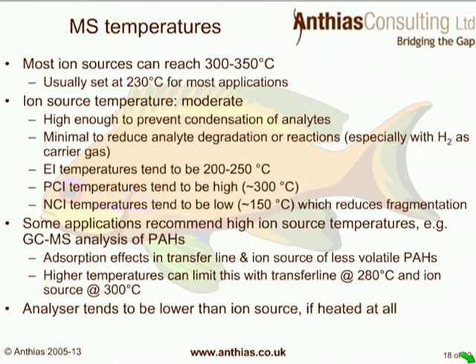If the analyzer, the mass analyzer, for example the quadrupole, is heated, this tends to be at a lower temperature than the ion source.